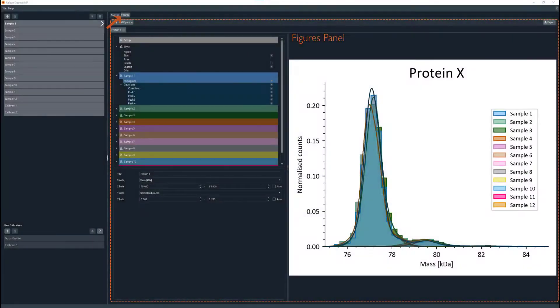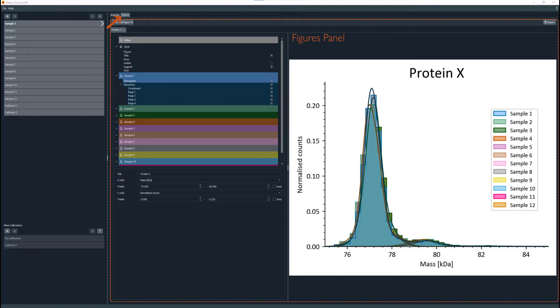When selecting the figures tab, the figures panel will be displayed. This panel enables the generation and export of publication-ready figures for the mass photometry data.